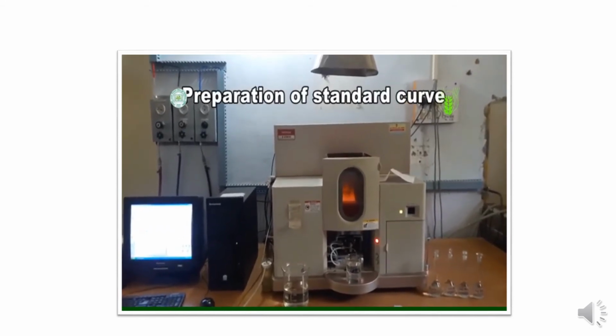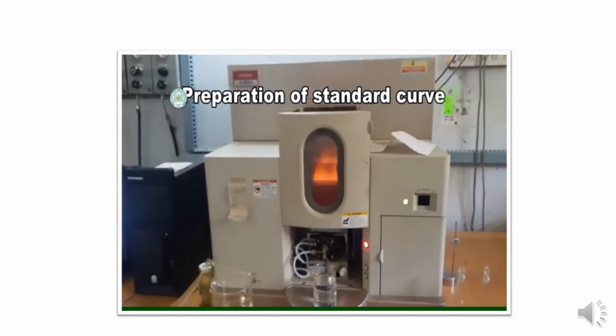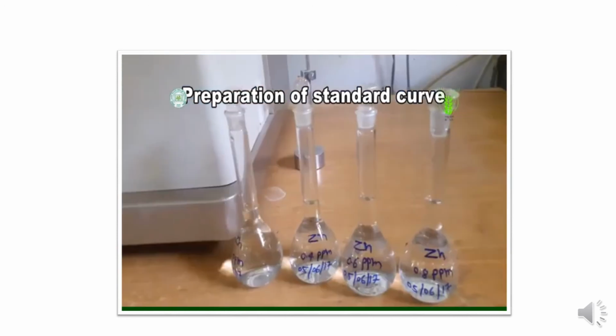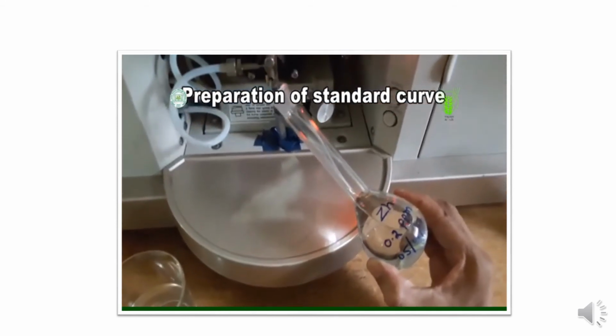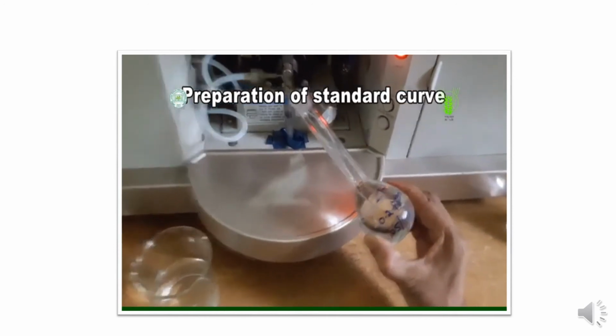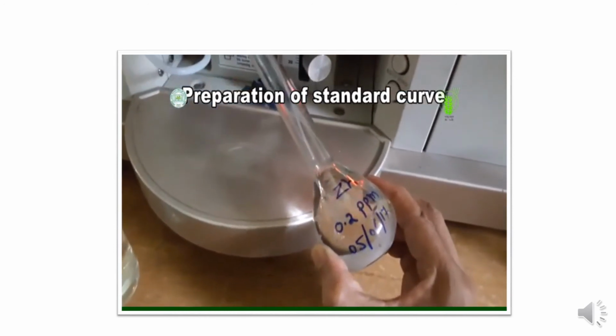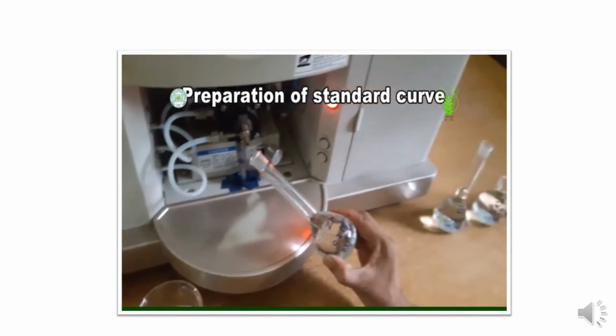Now after taking the filtrate, we need to analyze for the different micronutrients, and for the measurement of zinc, copper, iron, we need to operate the atomic absorption spectrophotometer according to the instructions provided for the equipment.